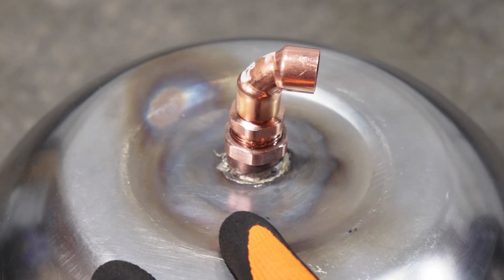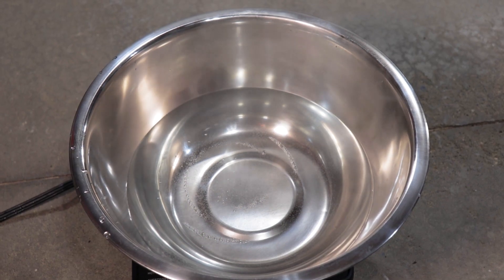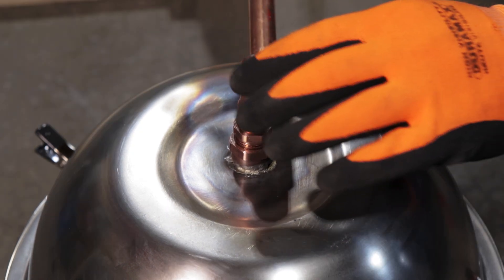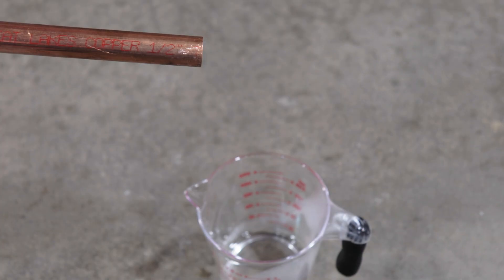With this we essentially have a water distiller. We can boil the water in the bottom bowl, add the second bowl on top to funnel the steam out through the fittings, and connect a long piece of copper tube to the elbow to act as a makeshift condenser cooling the steam. And this does in fact make distilled water — the only issue being that most of the distilled water coming out the other end is in the hot steam form, not in liquid form.